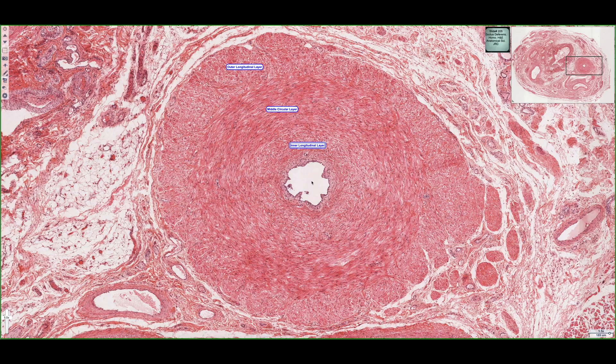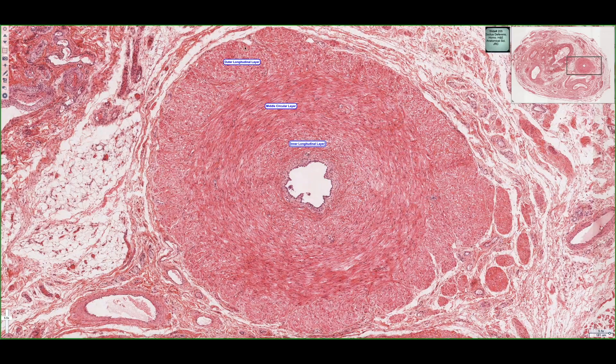This is a whole tissue section of the ductus deferens as it sits in the spermatic cord. The vas deferens, or ductus deferens, is a large muscular tube with a relatively small lumen, and it consists of three smooth muscle layers. Starting from the outside, we can see an outer longitudinal layer, a middle circular layer, and an inner longitudinal layer. The orientation of the muscle fibers of each layer allows for distinct identification of where one layer starts and stops.